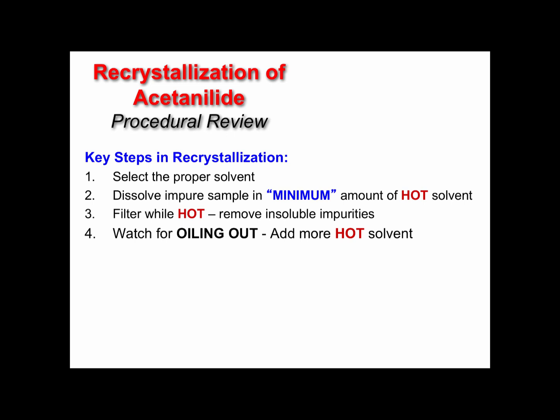Once you've got it into the minimum amount of solvent, you want to filter off the impurities. Now remember, we add an excess of solvent to give you a little bit of time for it to cool down, but filtering while hot removes any insoluble impurities. Watch for oiling out. If it's oiling out, you'll add more hot solvent.